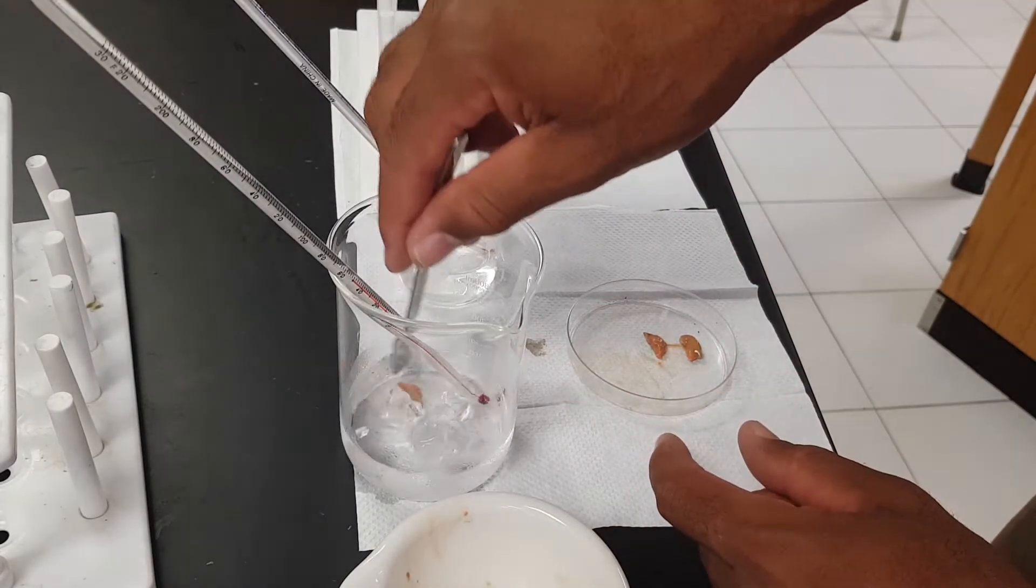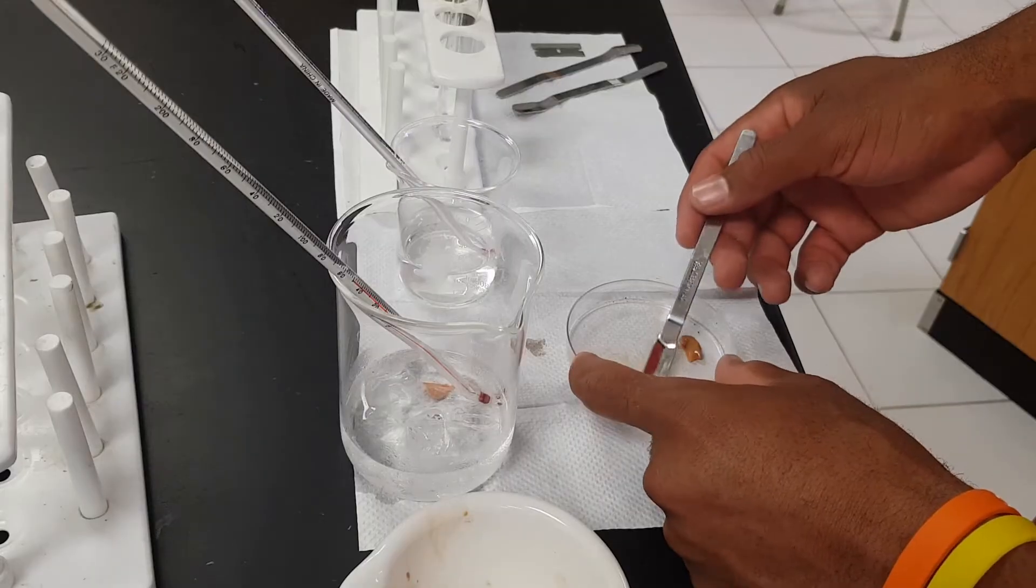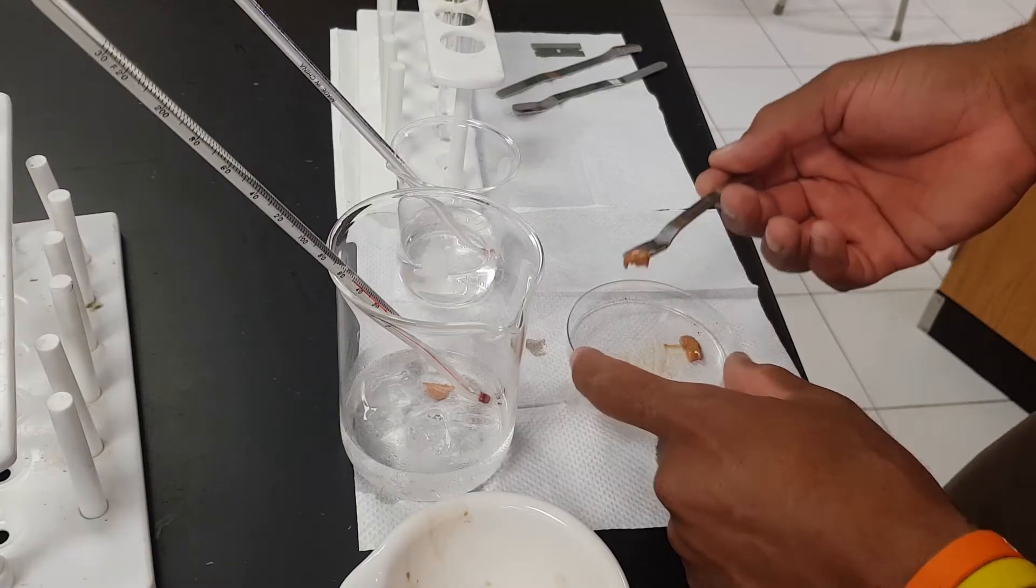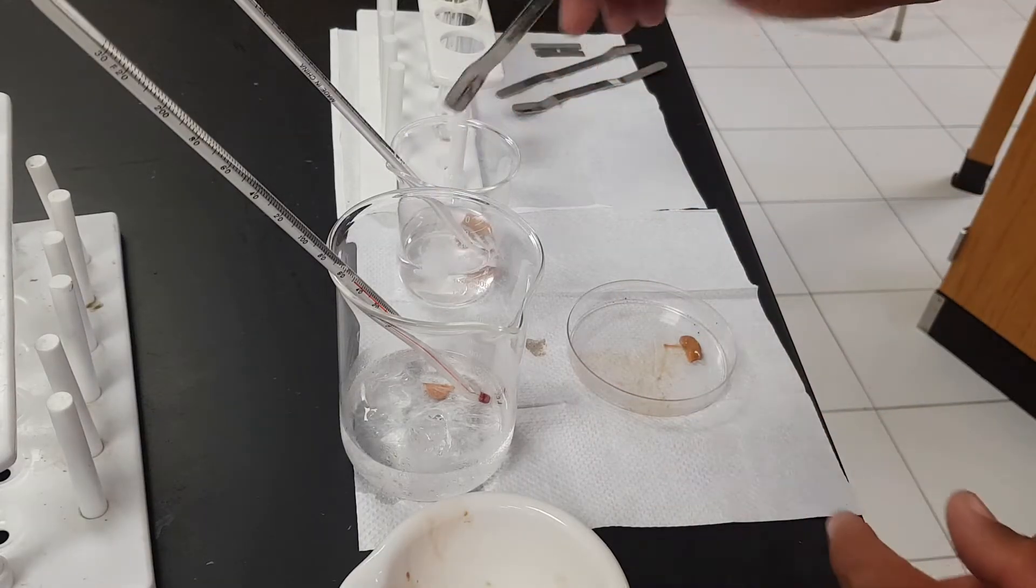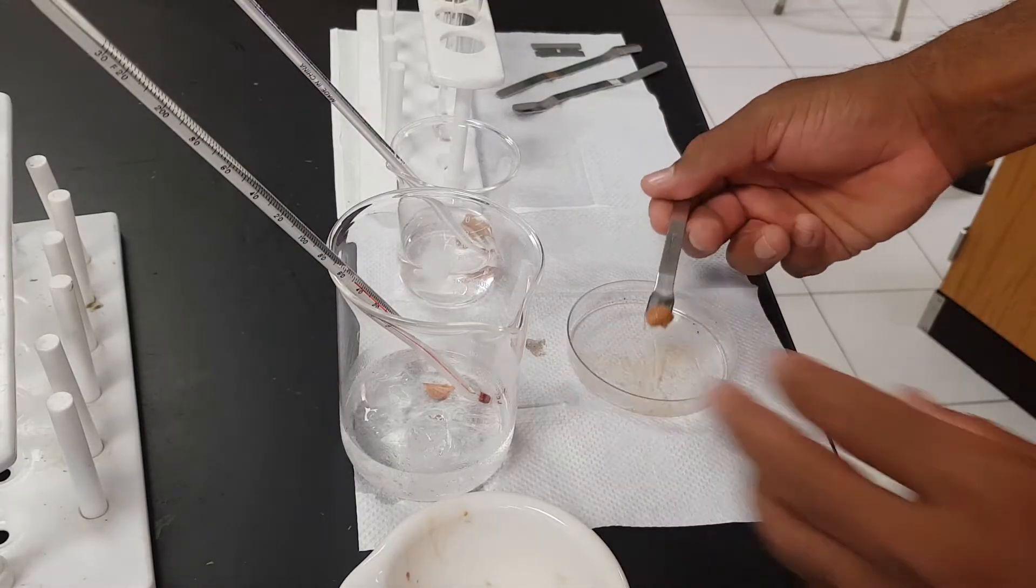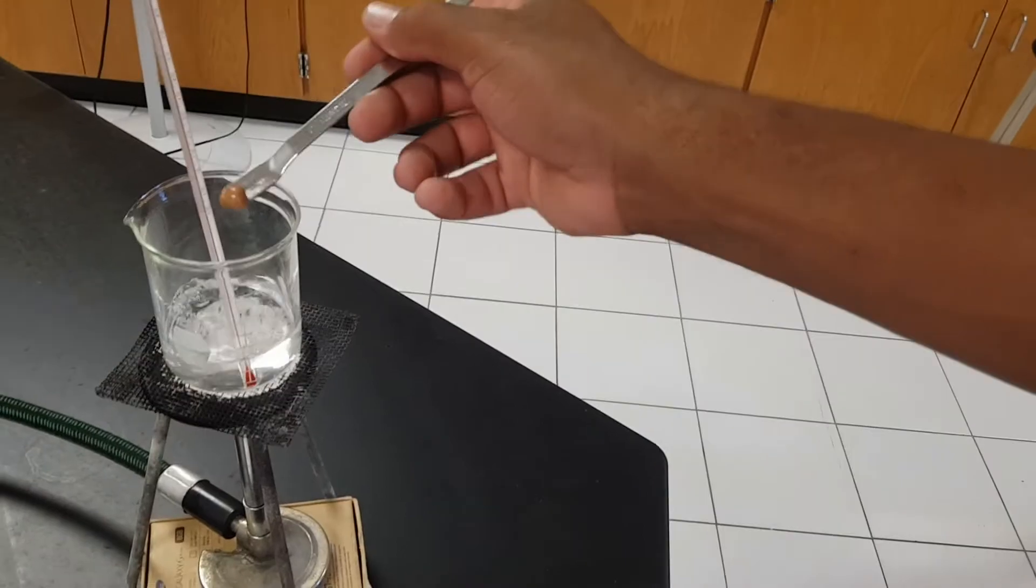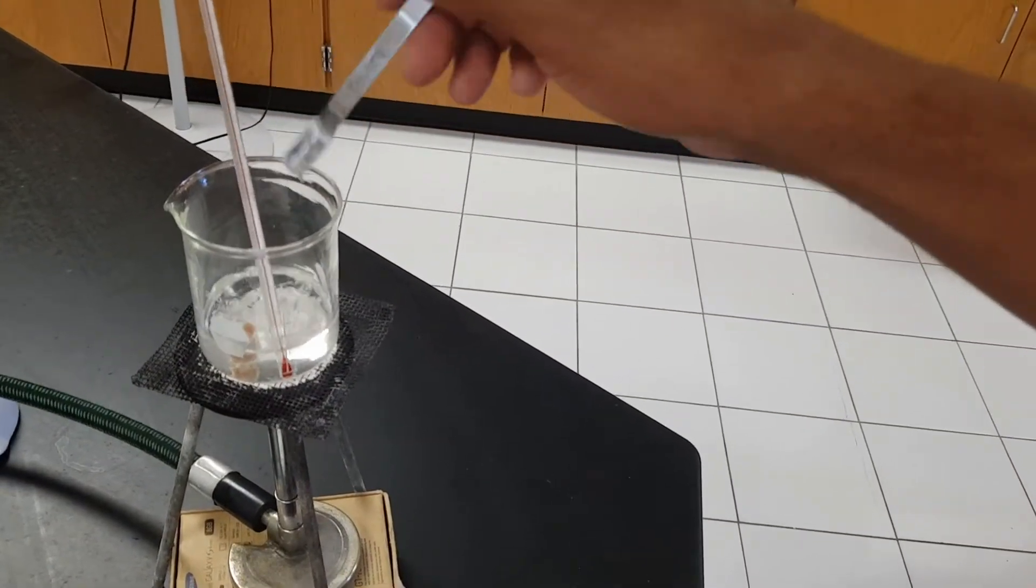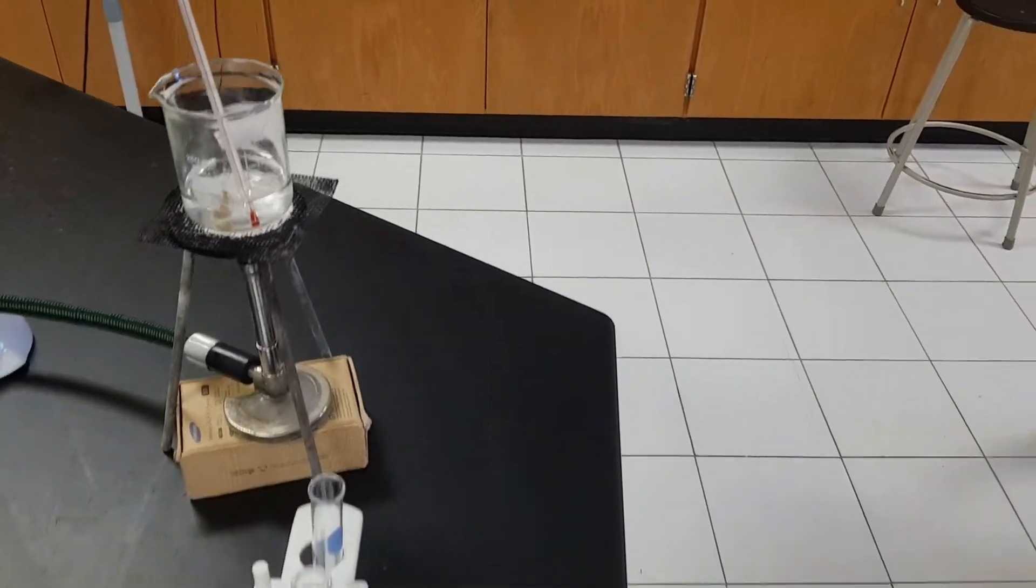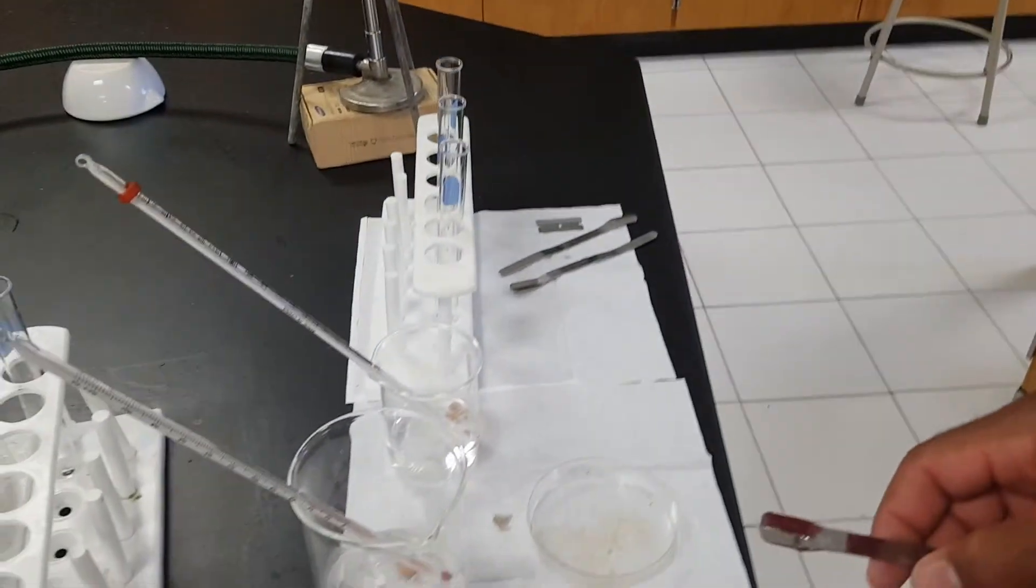Allow them to sit in the different temperatures for approximately three minutes. Pour this into the boiling water and again ensure that you take a note of the temperature as well.